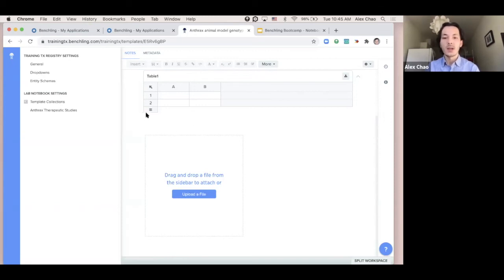And then 20% of folks also said that they will utilize these for team entry template sharing. So again, as we mentioned with the permissions that we're able to set for template collections, you can share your templates with any of the relevant members of your team.